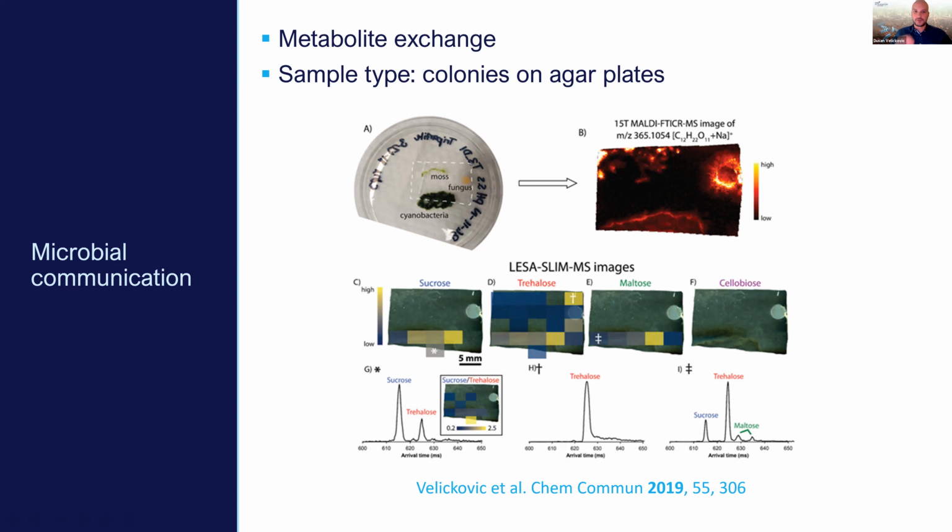That's just to acquire data. After that, we need to process the data as well, just to map the localization in the first figure. I hope I answered with this. Again, it depends on the number of pixels you will have, but approximately 1 second per pixel.